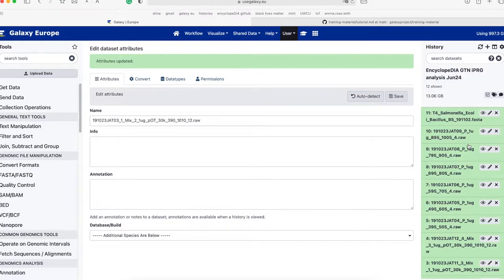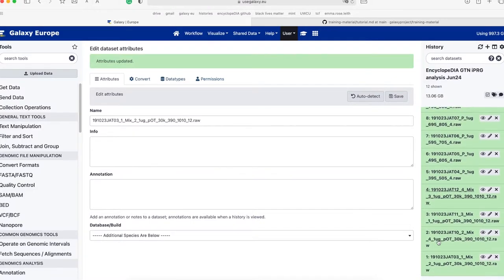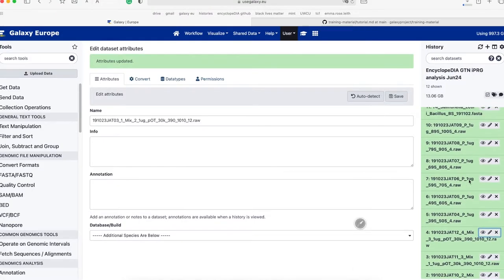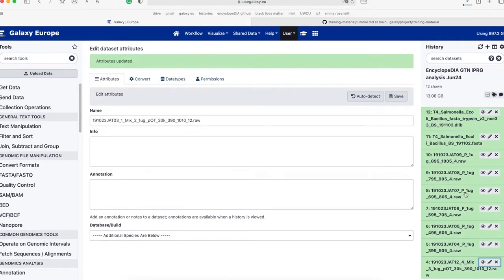As the data files are renamed, we can now create the dataset collections that will be required to run the workflow. We will create two dataset collections, one containing the experimental .raw files and the other containing the GPF .raw files.